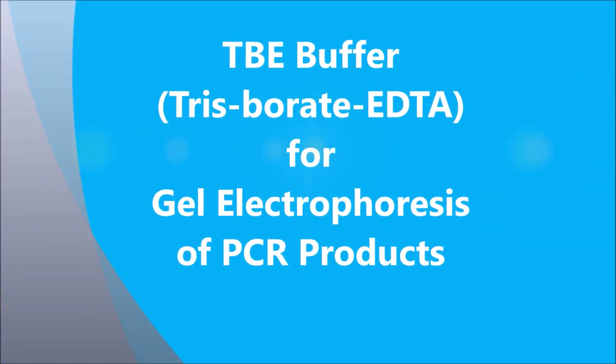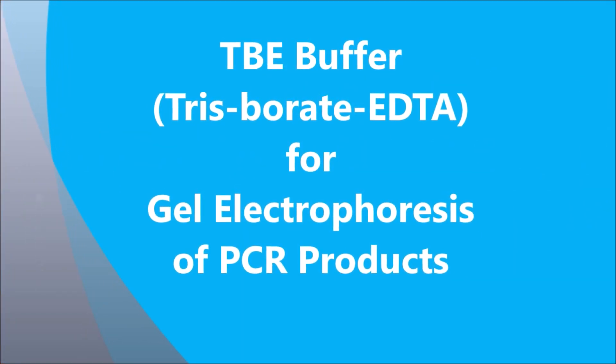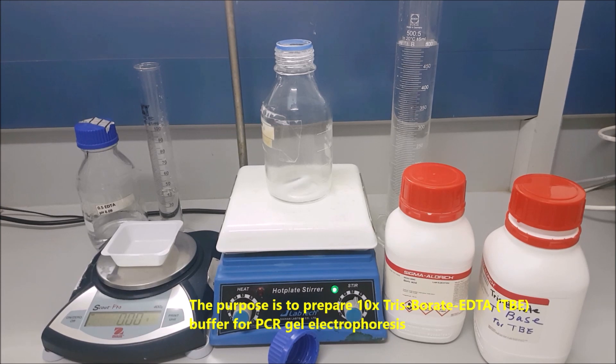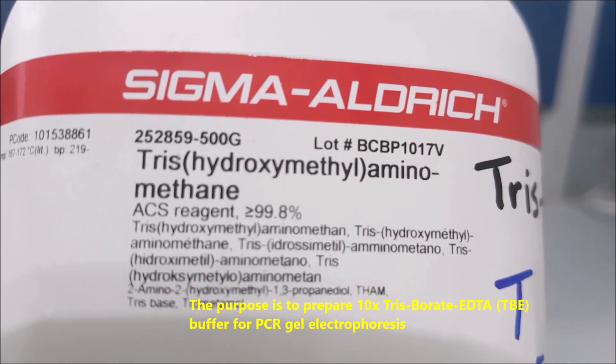TBE buffer for gel electrophoresis of PCR products. The purpose is to prepare 10x TBE buffer for gel electrophoresis.